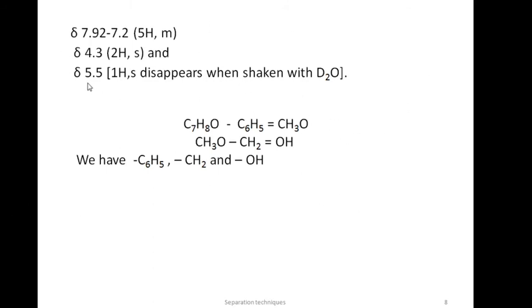Check here, even this proton is a singlet and it disappears when shaken with D2O.